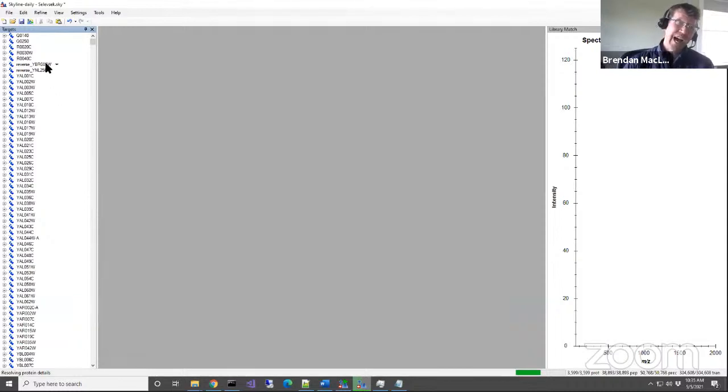So you can see that I now have, in terms of, I passed these all through, these were invisible to my search engines. They didn't know about these reverse underscore proteins. I just pretended they were part of my sample. And so this is a reasonable assessment of what the false discovery rate looked like to be pretty low, especially if you were using something that was built from 40 fractions. And so in this case, we just have 2 peptides or 2 proteins with 2 peptides each. And so extremely low false discovery rate.